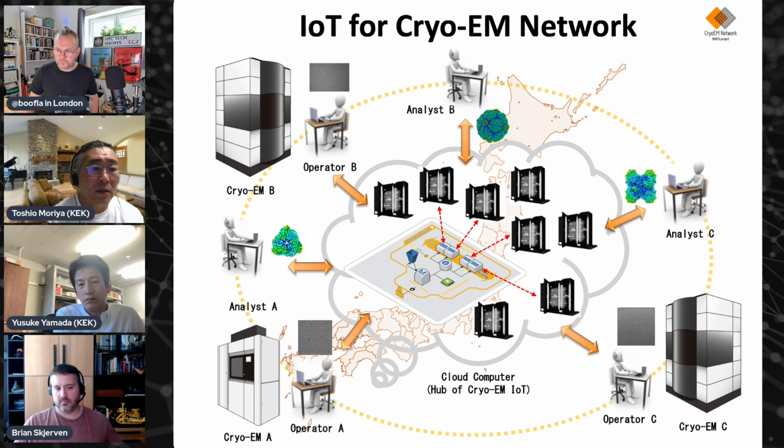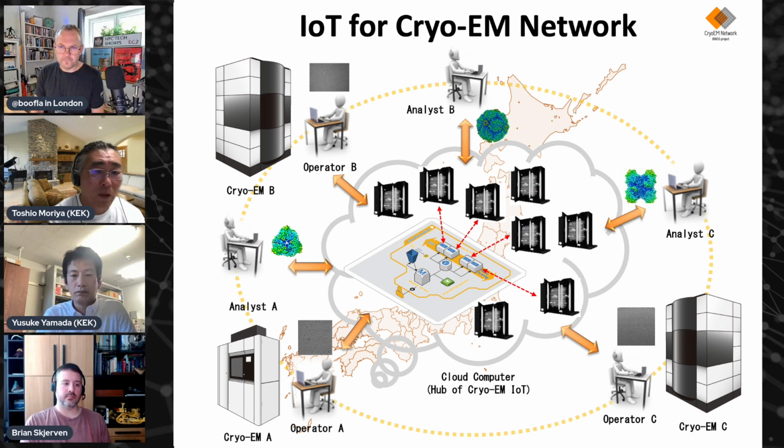And we came up with this idea because we are working for a shared facility, right? This is very helpful for the users. And I think it will help also other facilities and users. So this is what we are aiming for, using cloud computing as a hub of the CryoEM IoT.